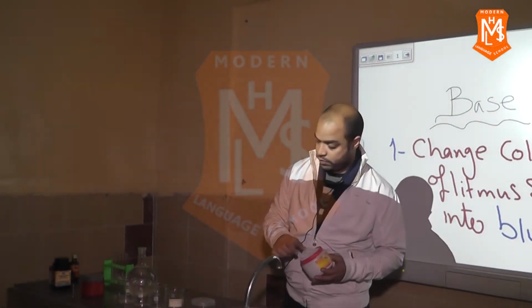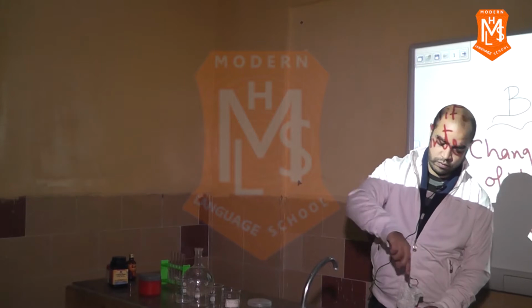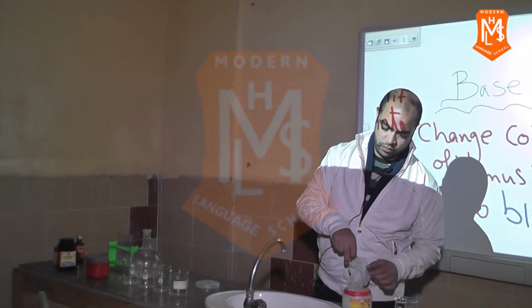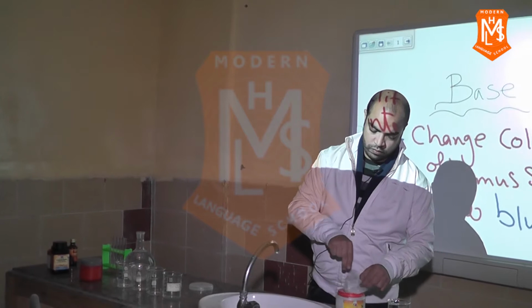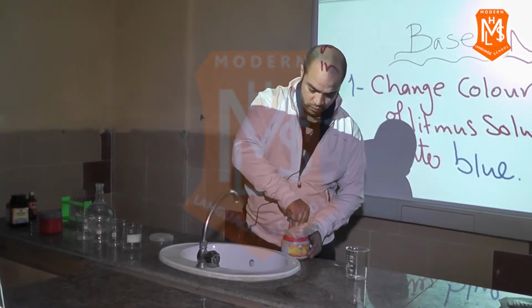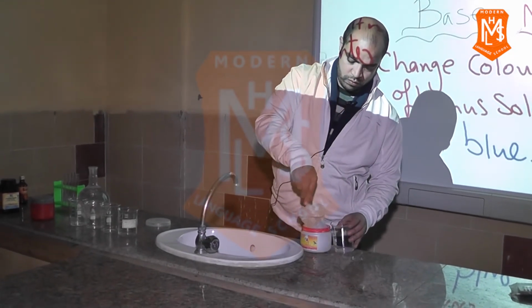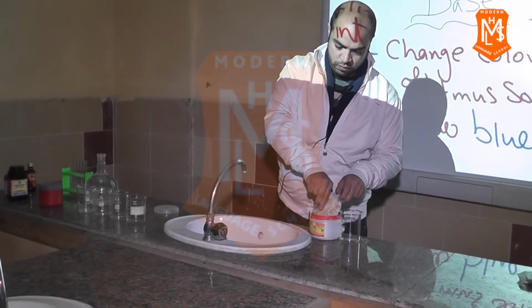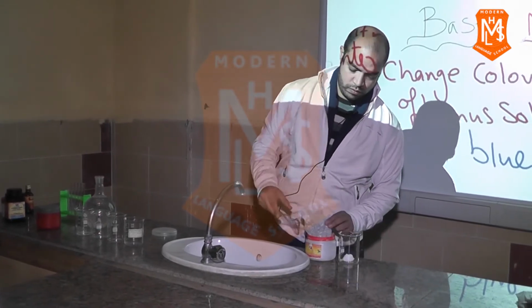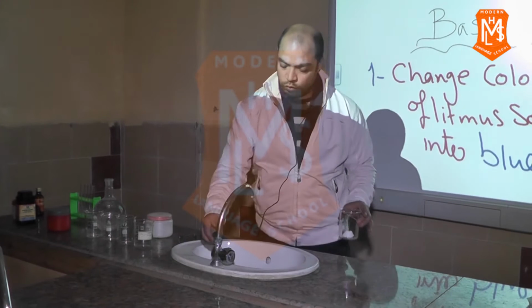Put some NaOH in a beaker, then dissolve the base in water.